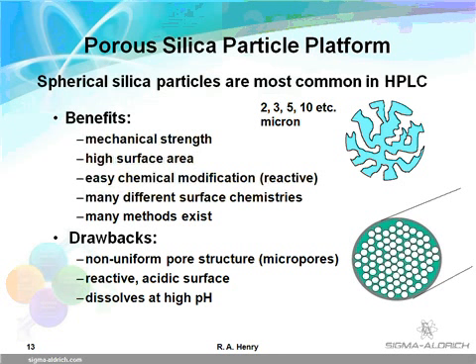Both high-coverage silica particles and hybrid silica particles will show reduced column lifetime when operated above pH 8 to 9 for extended periods. Careful selection of mobile phase additives and other operating conditions can allow acceptable silica column lifetime at high pH, but it should be avoided when possible for best results.